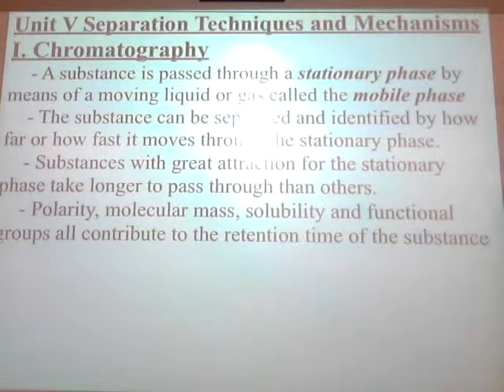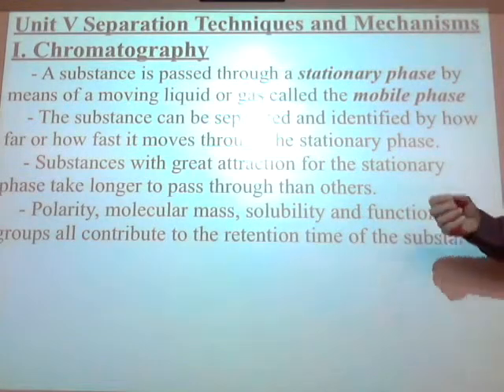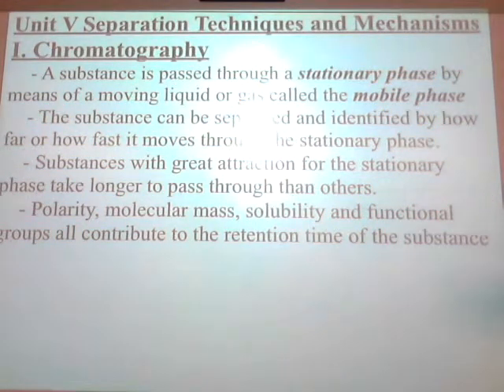Now, there actually are calculations involved in chromatography, at least in the first one we're going to do, paper chromatography. We're actually going to be able to do calculations. That's why I've got a picture down below. I'll show you how to do those. But let's talk about them now individually. We'll talk about paper chromatography, gas chromatography, and column chromatography. The last one, column, we'll save till tomorrow because that's what we're going to be doing.